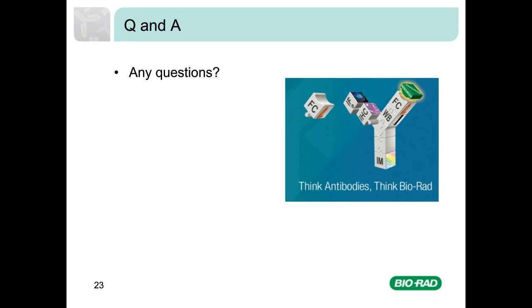There's another couple of related questions here. One is, how many cells should I collect? And another is, how many events do I need for compensation? Well, this depends on your cell type and your cell populations, but generally to analyze a population or compensate, we recommend between 1,000 and 5,000 events.